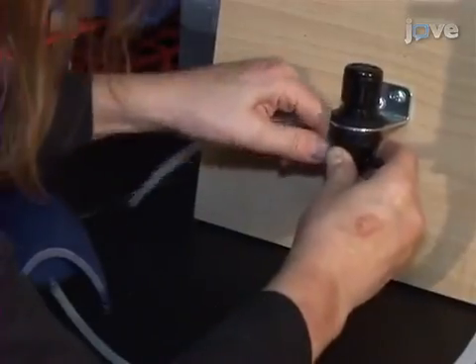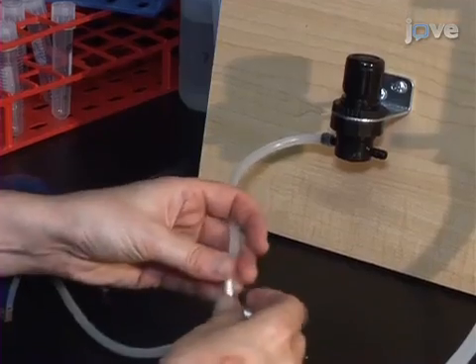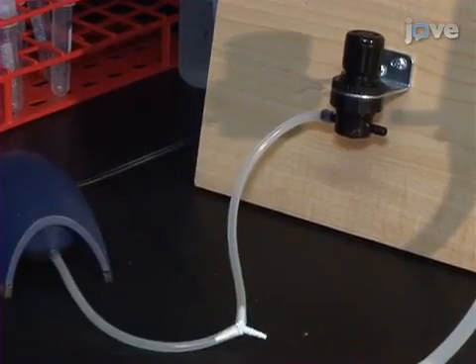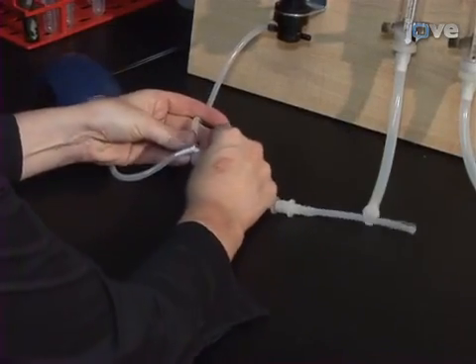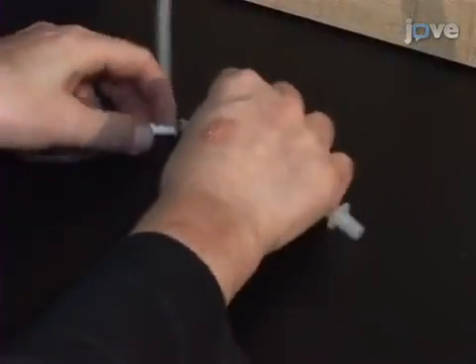Connect the first branch to a regulator. It will control the total amount of air through the system. Connect the second branch to a quick connector. This will allow the airstream to be interrupted as needed.